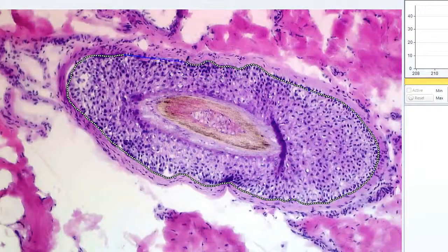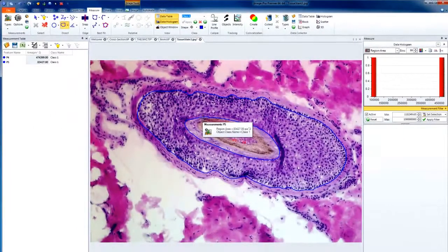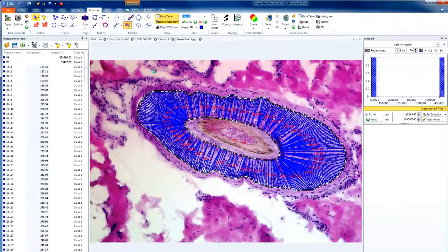Much like our last example, I'm able to create two different polygons, double left click when I'm completed, choose my arrow, select both, and create a relative measurement between the two of them. Seeing as how I have two polygons with irregular lines drawn, my step size is going to follow the object line and not the reference. It will calculate a directional line based on the internal polygon.